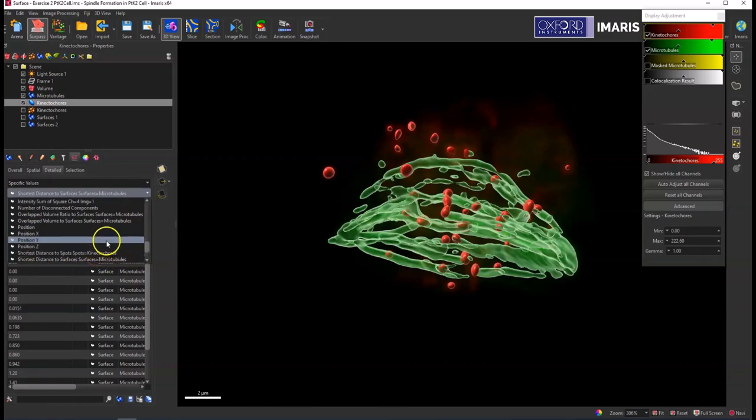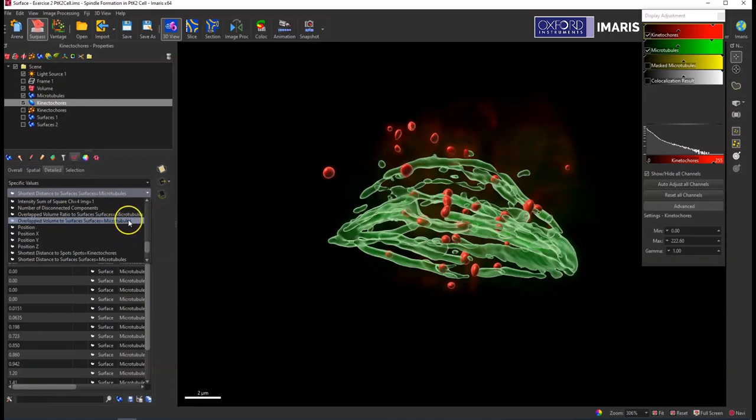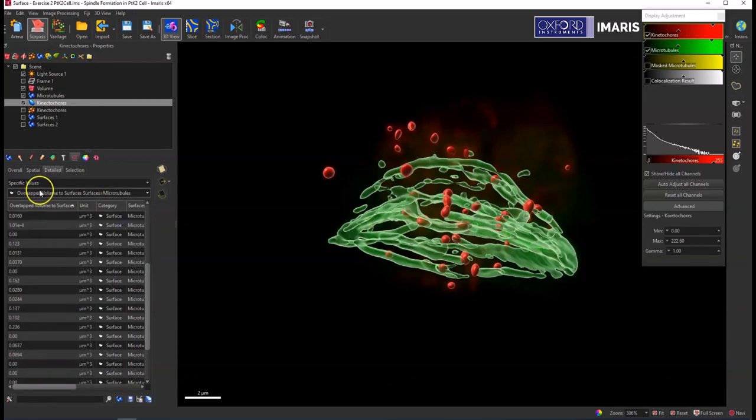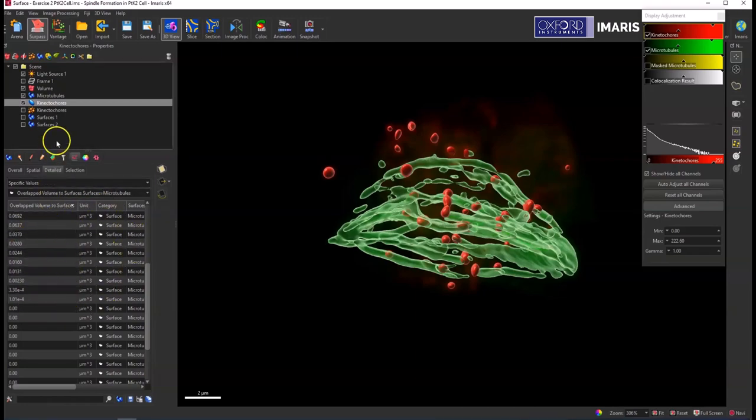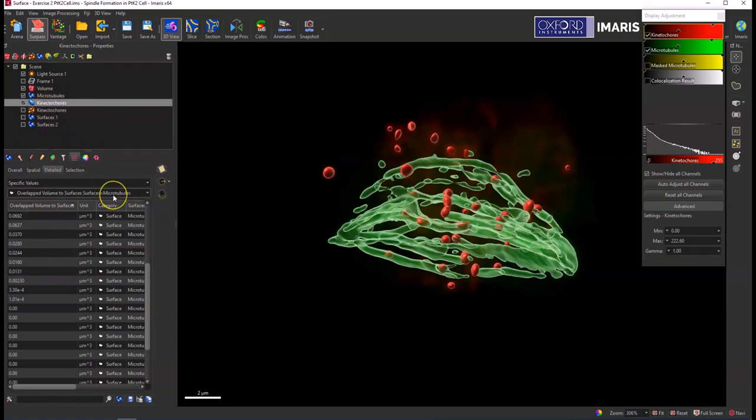Then the other statistic of interest for object-object statistics for surfaces is looking at the overlapped volume comparing it to the surface object. So this will give you an output in microns cubed of how much of, in this example, the kinetochore surface is co-localized or overlapping with the microtubule surface.